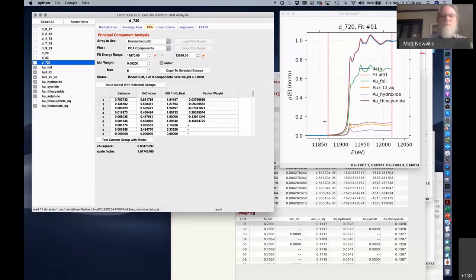Okay, fair enough. And I'm going to take this last question and then we'll go to the break, because I guess you need a break as well. The question is more about how to choose the proper reference. For example, some of them have more intense features and some have less, but if you choose them all, you may lose the chi-square. So do you have a general comment on how to choose proper reference spectra for the LCF?